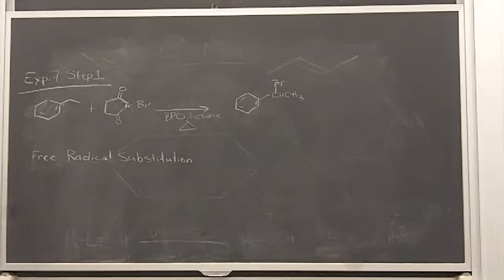Unlike a couple weeks ago, where once you got your reaction going when you were making the sodium myristate, things refluxed nicely for an hour and just stayed like that, this is one where you really have to pay attention to what's going on, because of the different stages of what's happening in the radical chain reaction.